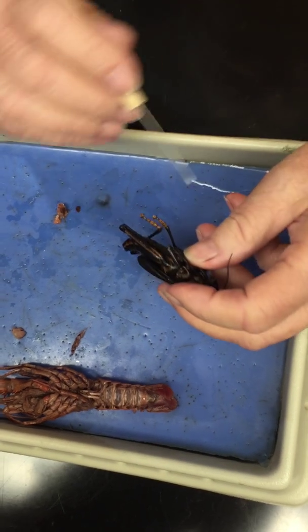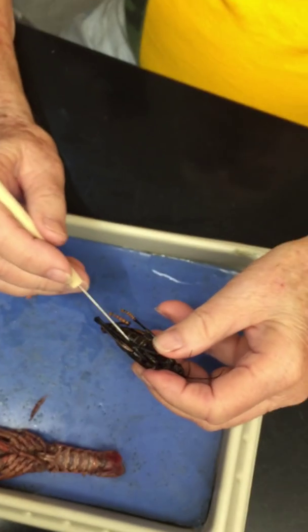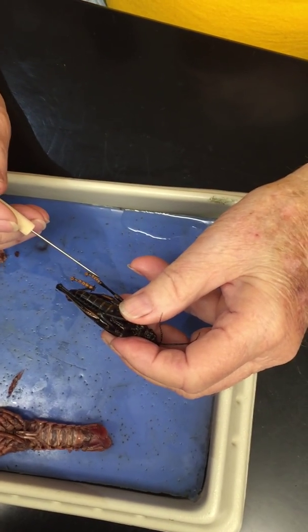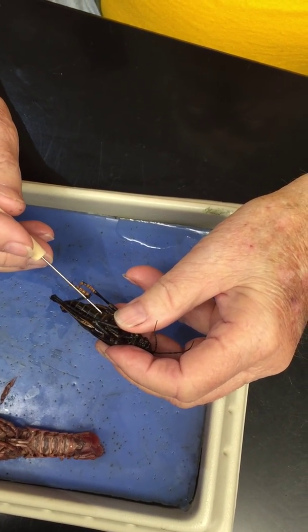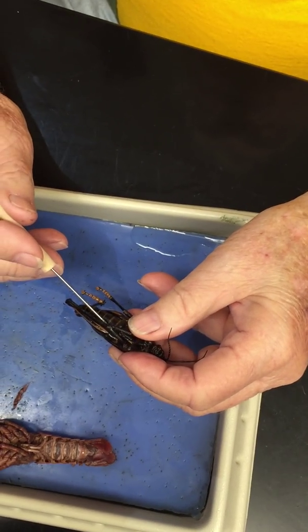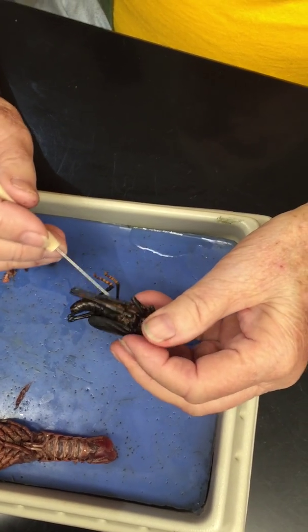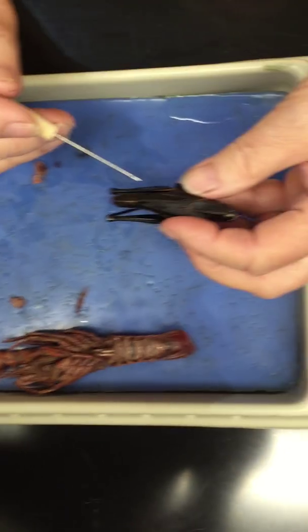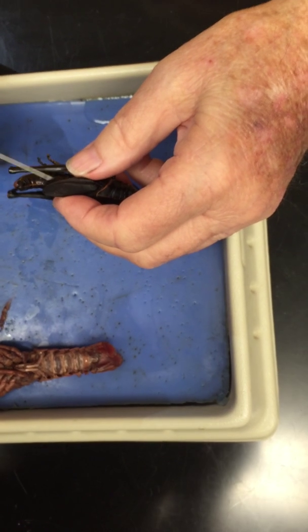Sarah has different words for it. And see, what would you call this? On a grasshopper, what are you going to call this plate on the bottom of the abdomen? Sternum. Is it going to be called a tergite? No, not a tergite, but a sternite. And on the top, what are you going to call it? Tergite.